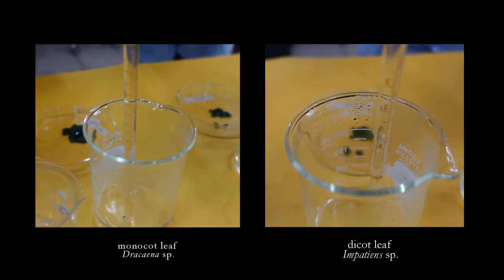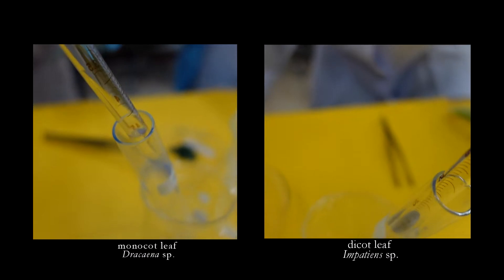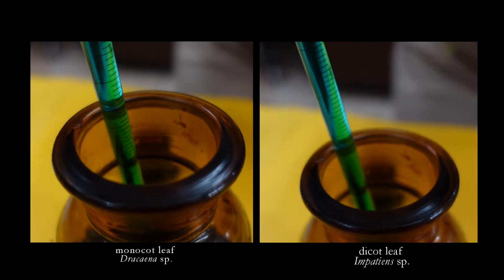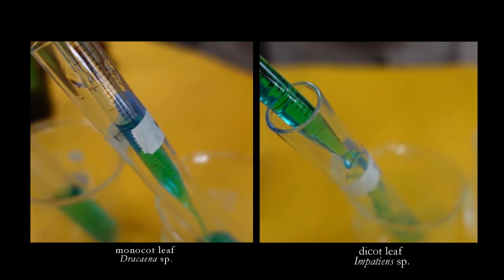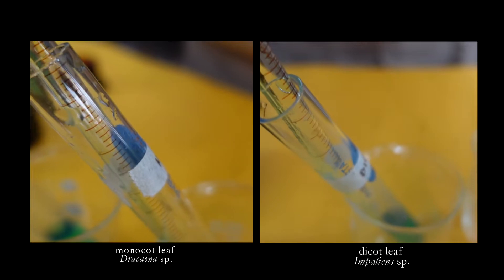In this test, transfer 3 ml of the monocot leaf extract into a test tube and then add the same volume of Benedict's reagent into the test tube. Do the same for the dicot leaf extract.